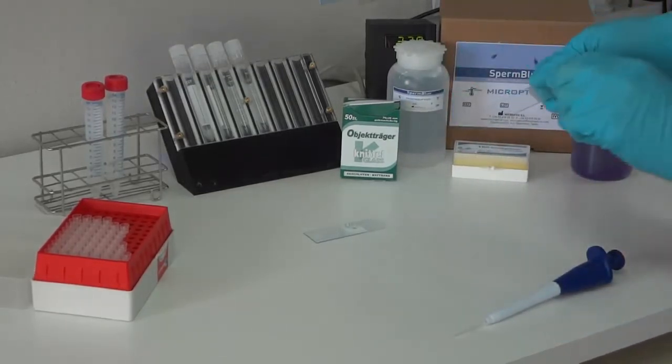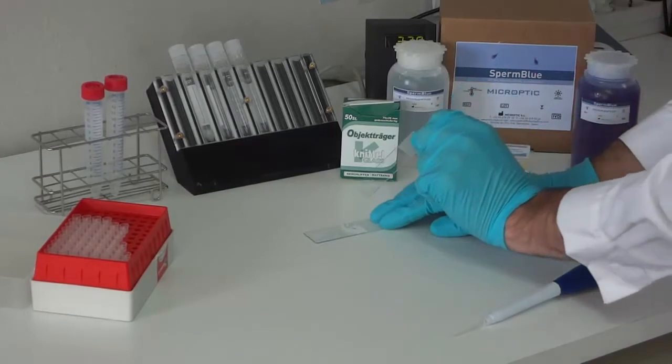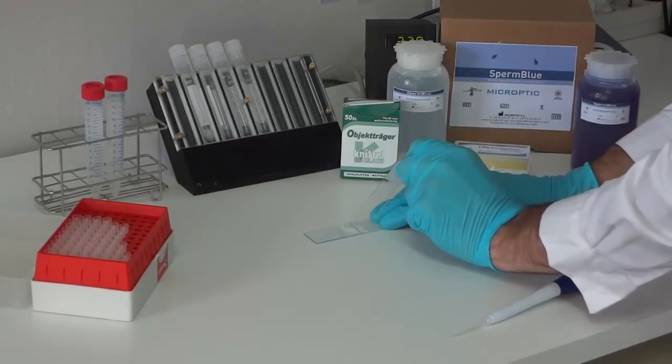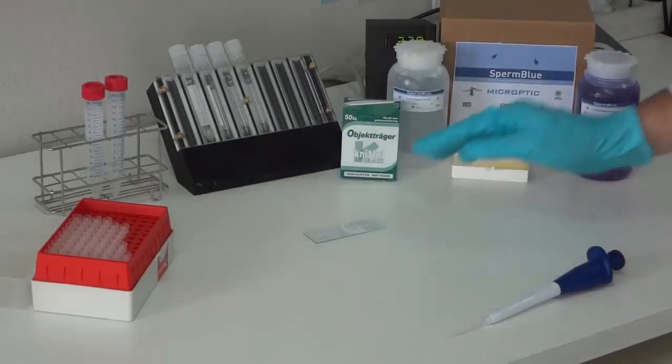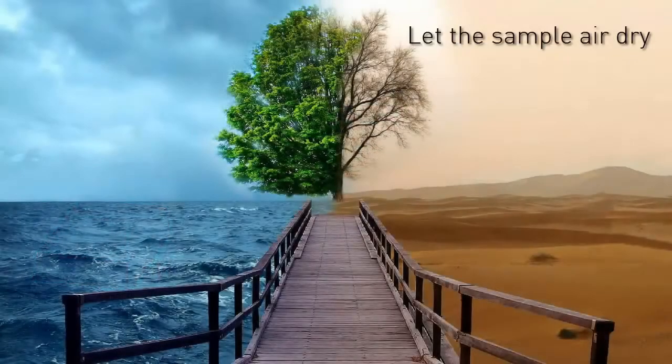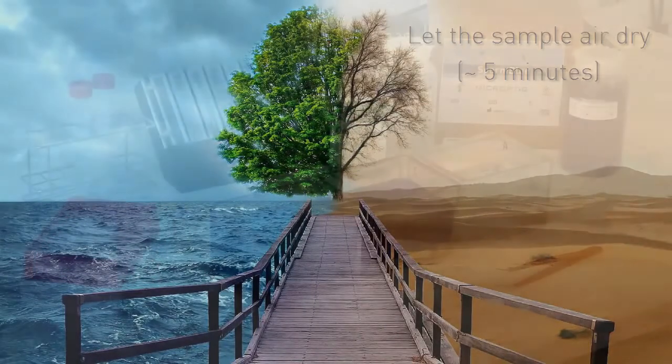Use a second slide, placed at a 45 degree angle, to pull the drop of semen along the slide surface. Allow the slide to dry in air and follow the staining protocol.